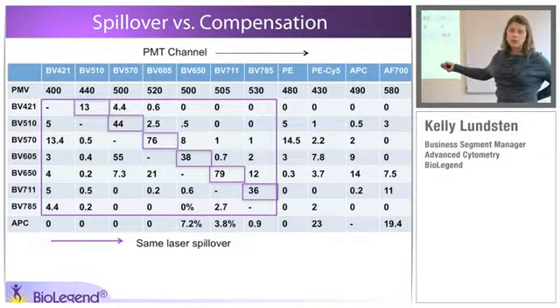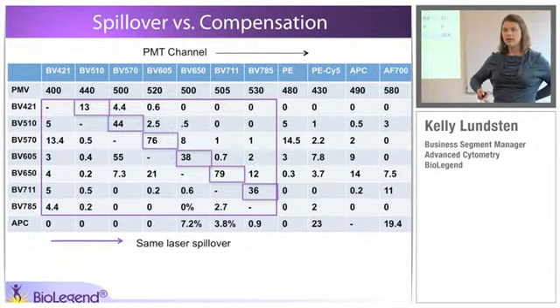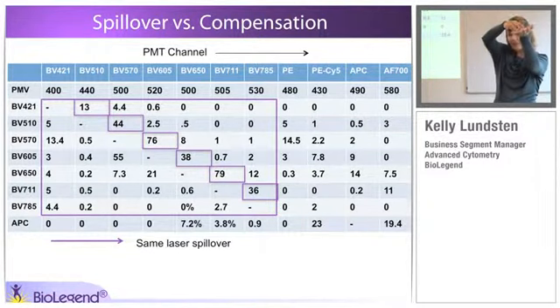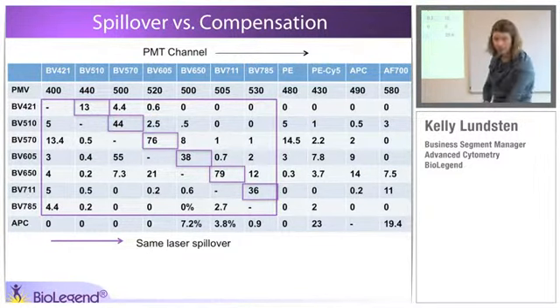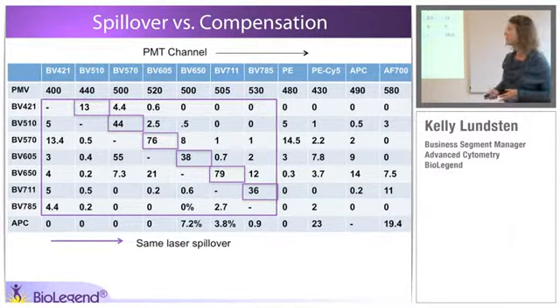Whether or not that value causes you any trouble, high comp values do not mean reduced sensitivity. What they can mean is if the marker is highly expressed and the fluorophore is very bright on the thing that's spilling into its neighbor, and the neighbor is very lowly abundant and very dim, then that high comp value could mean reduced sensitivity. But it doesn't always, it's not a default.